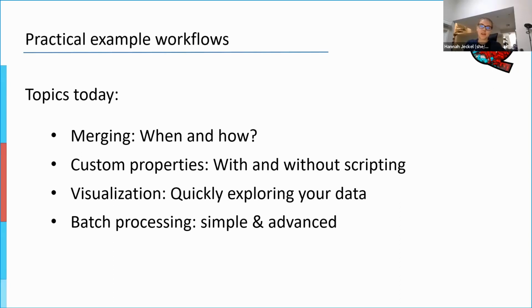Since this is an advanced workshop, I do hope that you have at least a little bit of experience with BiofilmQ. You have a rough idea what it does, or maybe attended some of the previous workshops by Eva and Niklas, which were really great over the past 2 days. If that is not the case, you can still follow along and then catch up later on by watching some of the tutorials, and maybe I can show you where to find them.